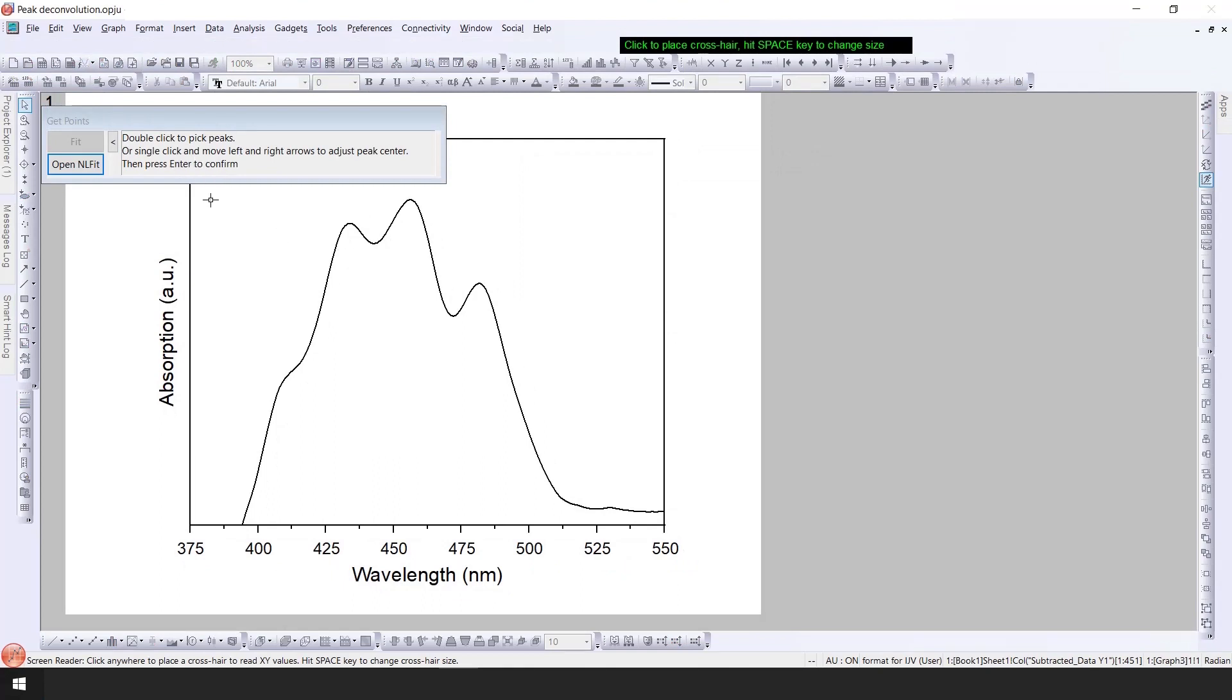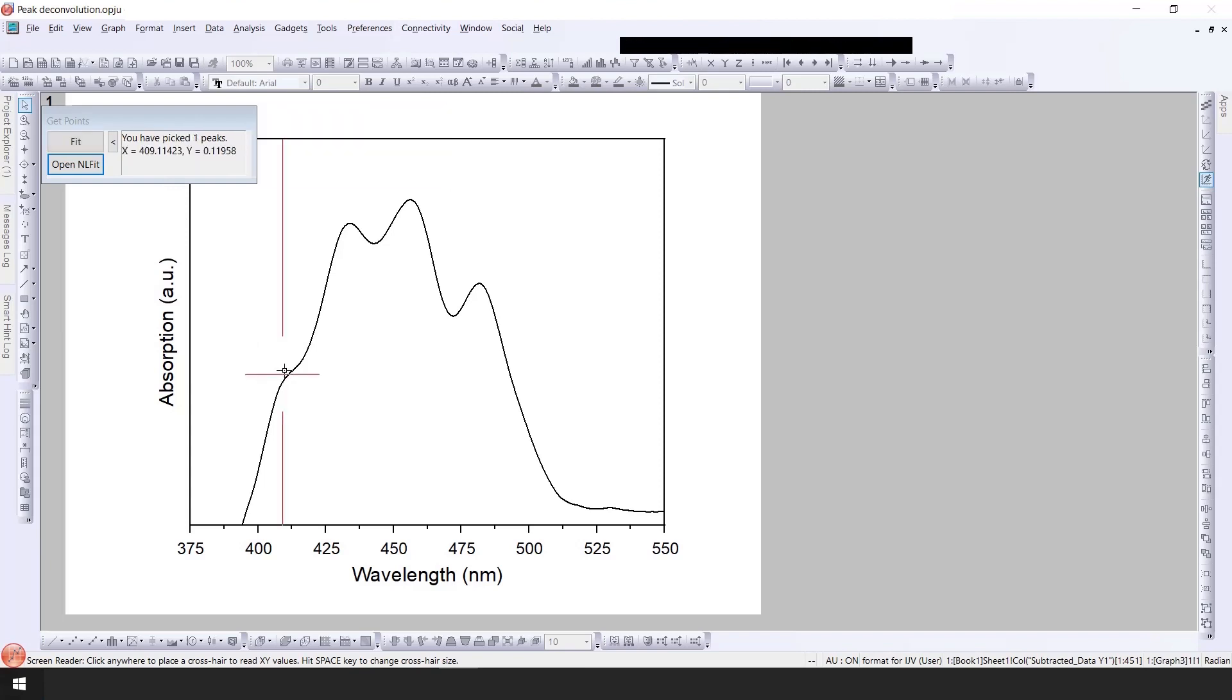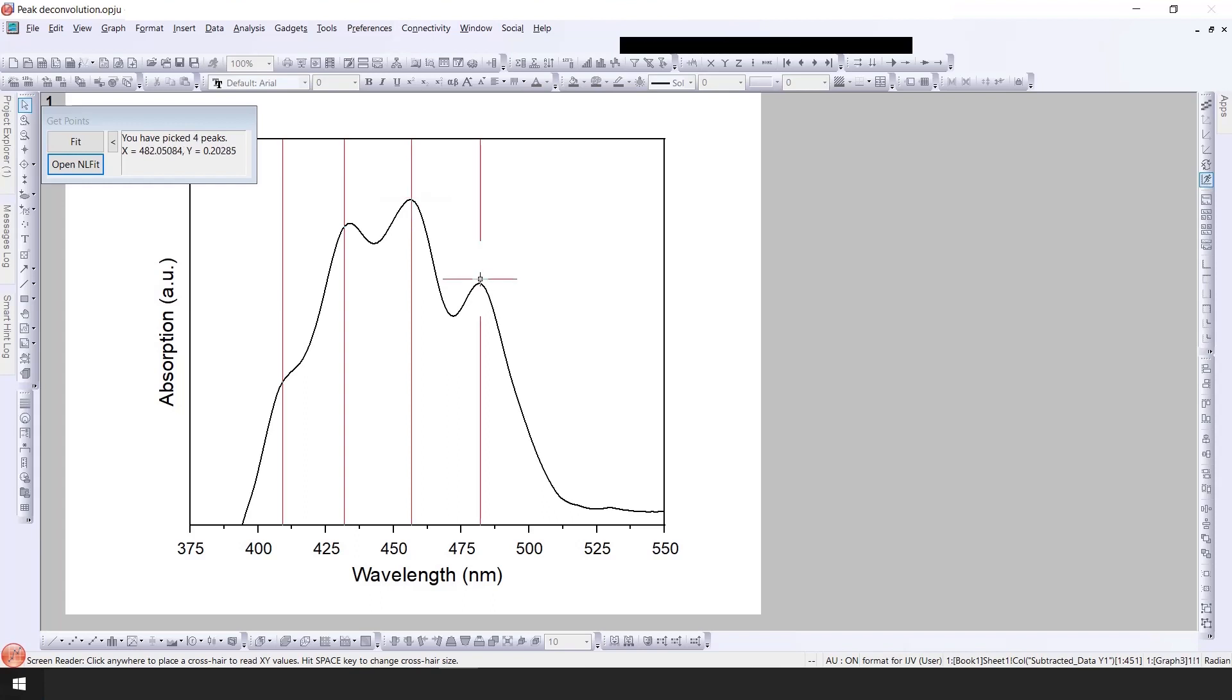Here you have the option to select all the peaks and then you can fit automatically or manually. First step is to click the peaks. I will click this peak by double clicking, then second peak, third peak, and then fourth peak. Then I will click on open NL fit.